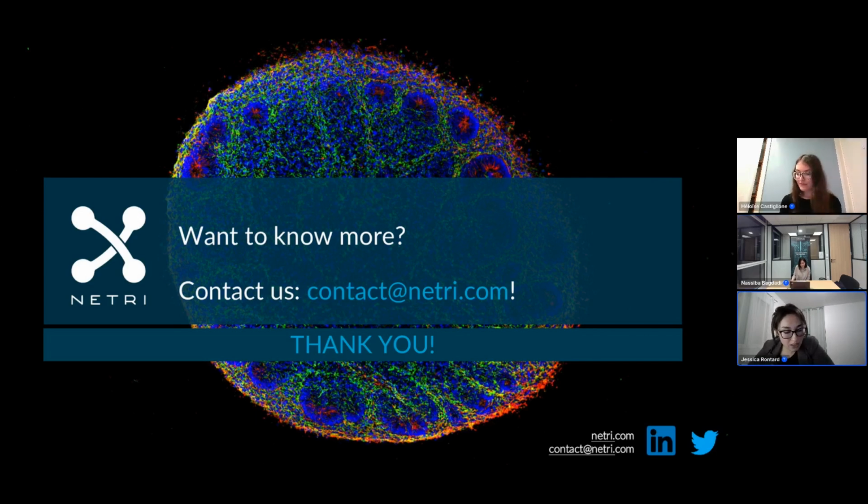We imagine adding 3 other cell types, so astrocytes, pericytes, and also brain endothelial cells on the bottom of the device. On the bottom, yes, sorry. So did we answer your question, hopefully? Are there any more questions?